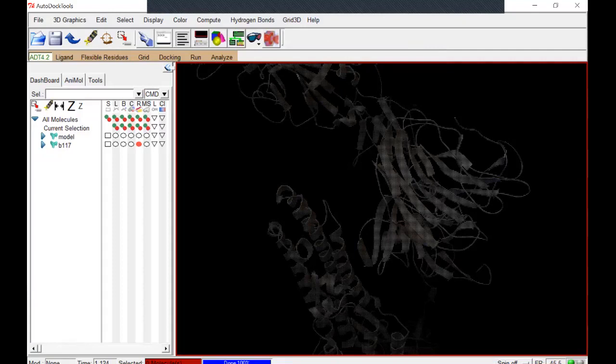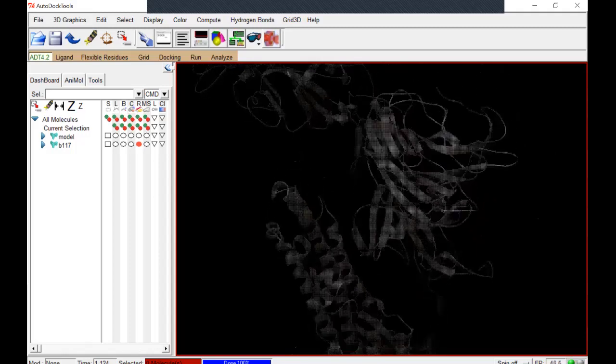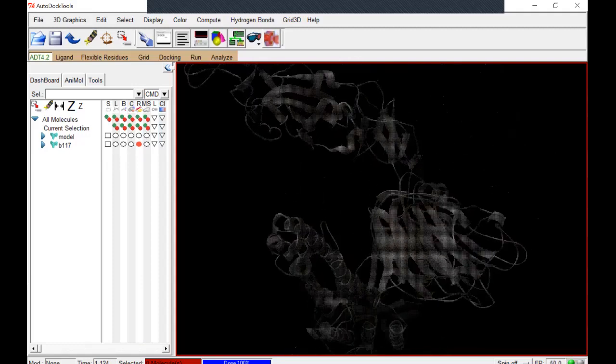All right, so to lay the foundation, I did a first video about SARS-CoV, which was the original SARS back in 2003, 2005, and talked about the P shuttle vector and how to make the adenovirus vaccine. So this structure here is the UK variant, B.1.1.7, all right?